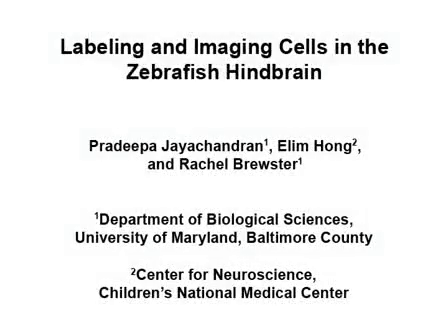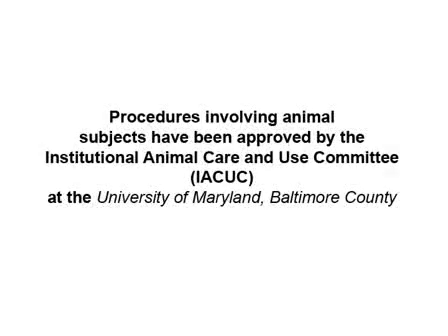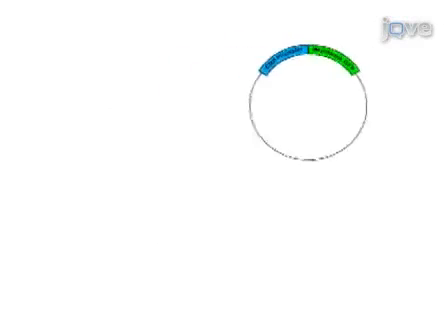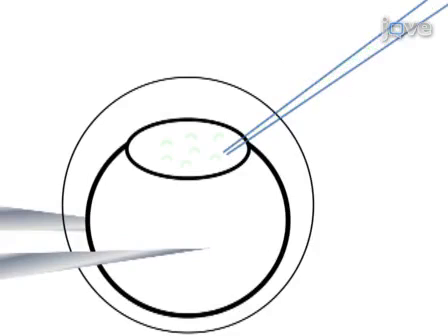The overall goal of the following experiment is to image neural cells at high resolution in the zebrafish embryo. First, DNA-encoding membrane-targeted green fluorescent protein is injected into a one-cell stage zebrafish embryo, which results in mosaic inheritance, thereby enabling enhanced imaging of scattered cells.